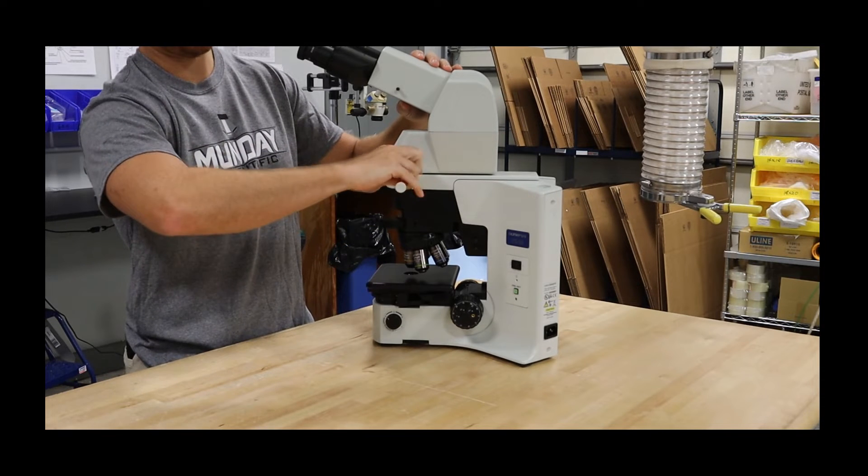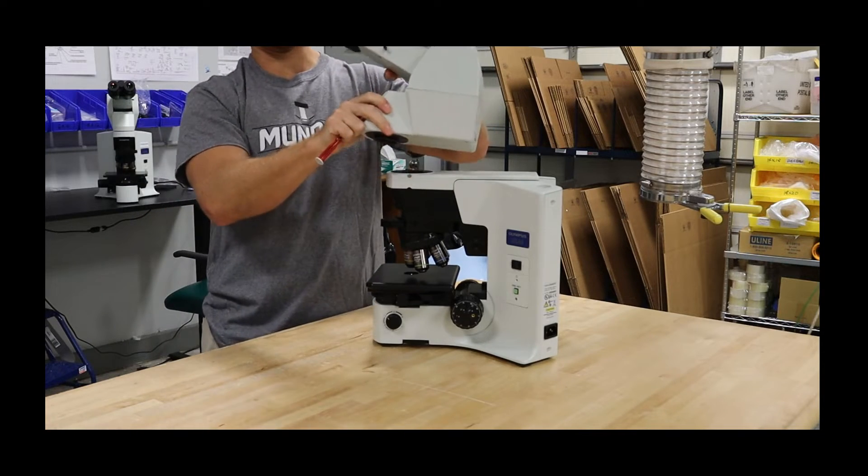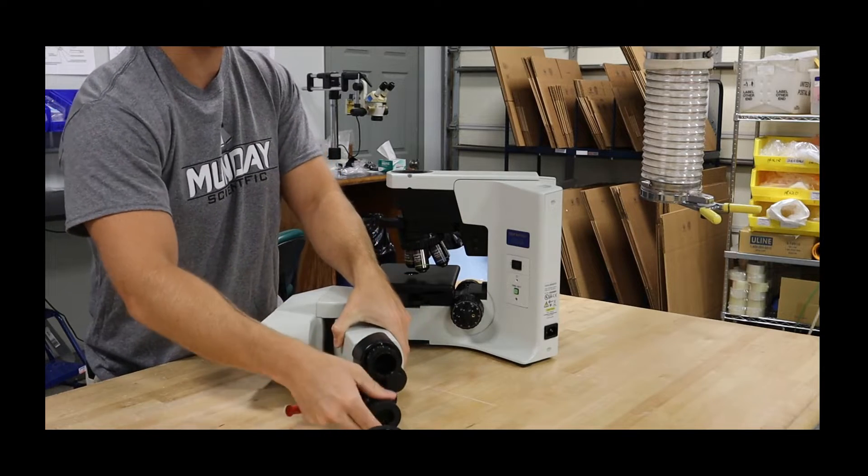It goes here in the Allen screw. Always keep your hand on the head — two hands — because the eyepieces will fall out. Once you get it down, take the eyepieces out.